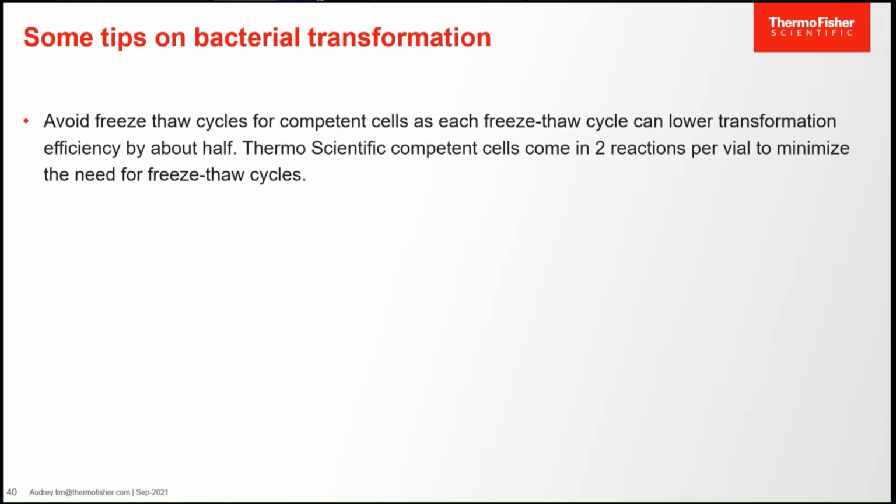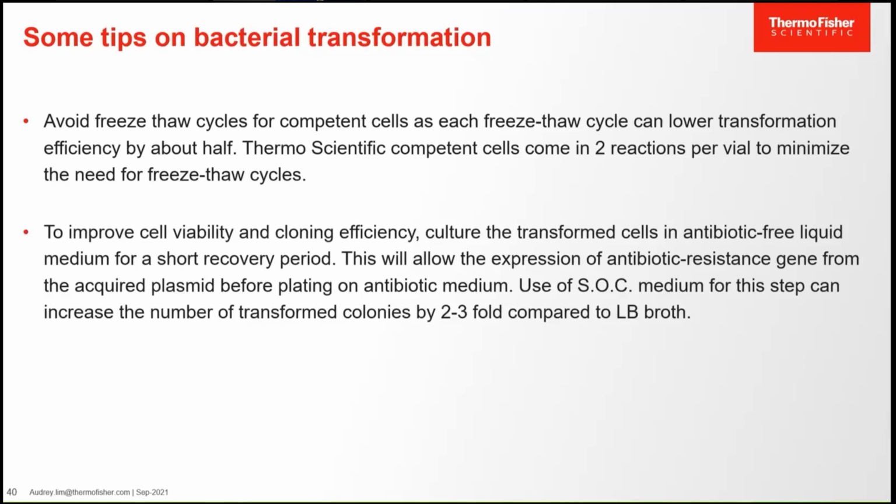Okay, and another tip to improve cell viability and cloning efficiency is to culture the transformed cells in antibiotic-free liquid medium for a short recovery period, for example 45 minutes to 1 hour, before plating on the antibiotic medium.